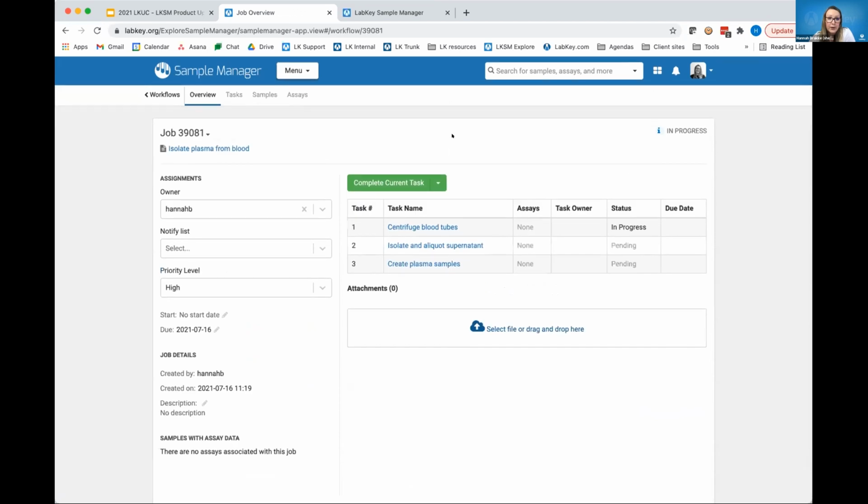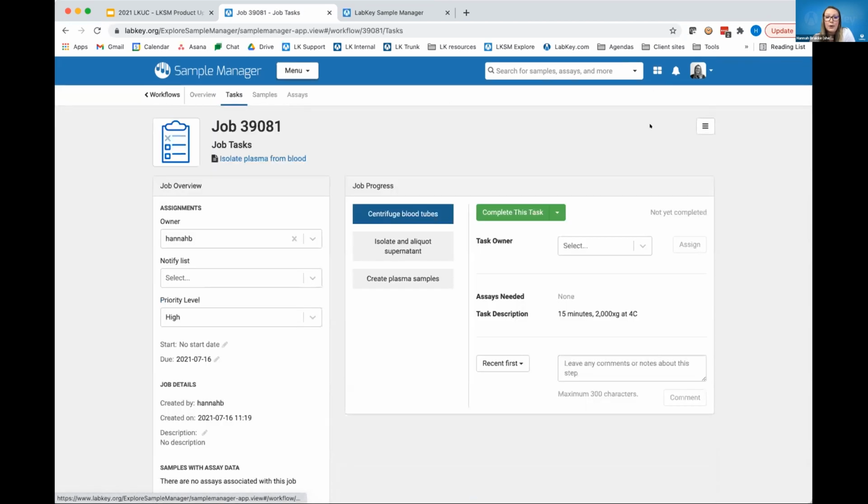At this point, I'm not able to make edits to the job, but if I were to instantiate an ad hoc job or create a job from a template and then make changes in advance, we have this standard template, but I want to alter it a little bit in what I'm going to do. It's really meant to be that premeditated work that you're doing in the lab.